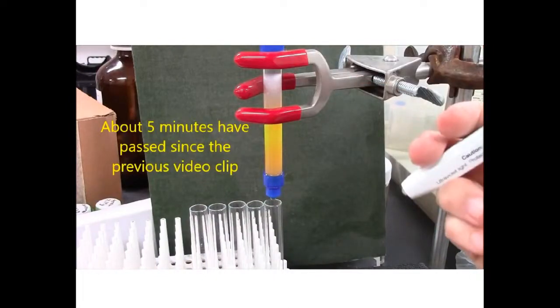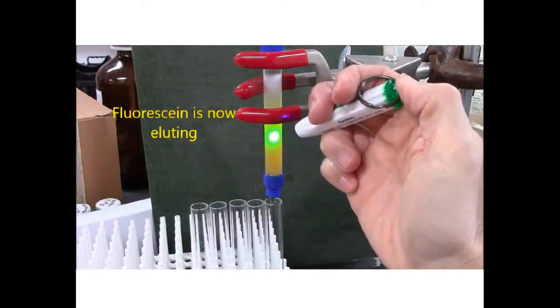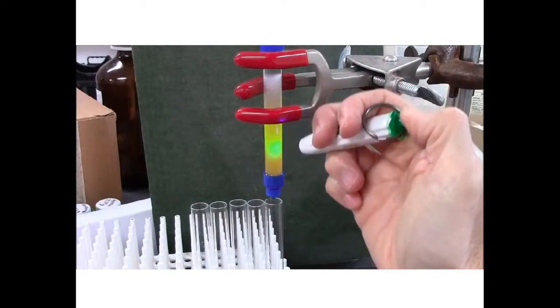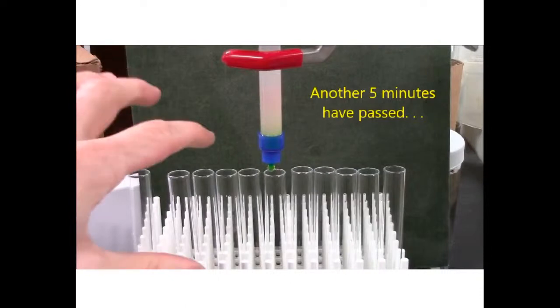The fluorescein is now eluting from the column. Fluorescein is fluorescent. I'm shining a little blue light, UV light, on it, and you can see it glows green. The last little bits of fluorescein are emerging from the column now.